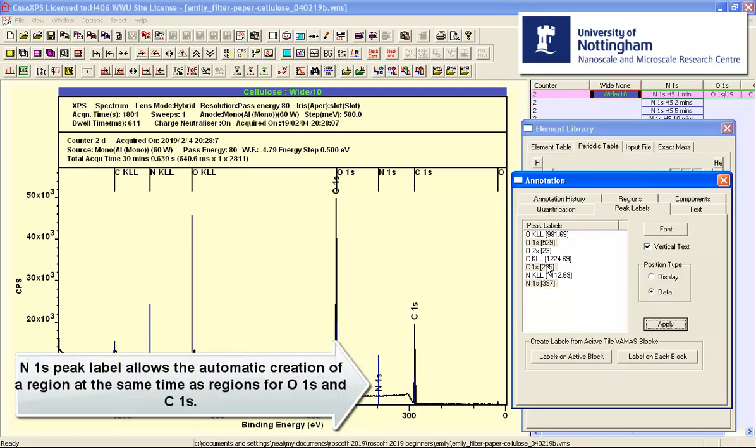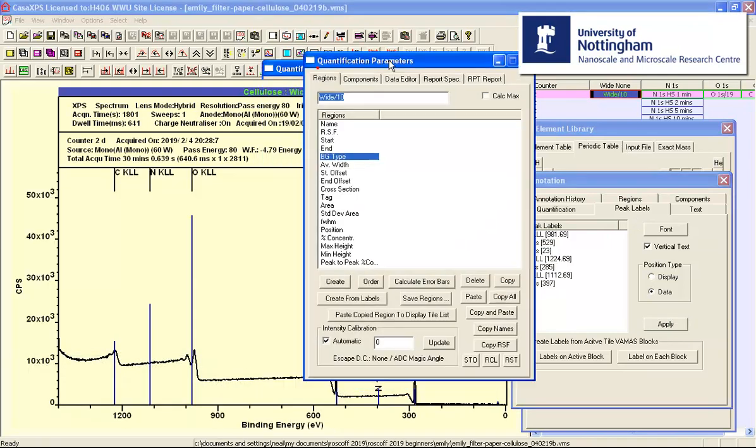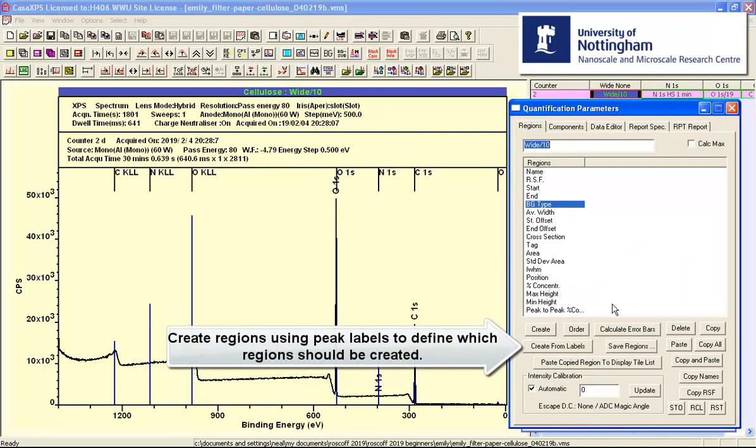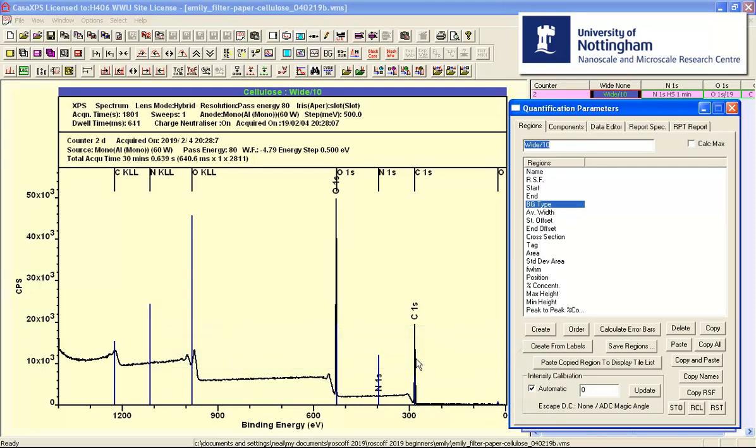And these are indicated as peak labels. When I use the quantification parameters dialog window on the regions property page, I can say create from labels. And this will force the creation of regions based on these labels that provide the link between the element library and these peaks.